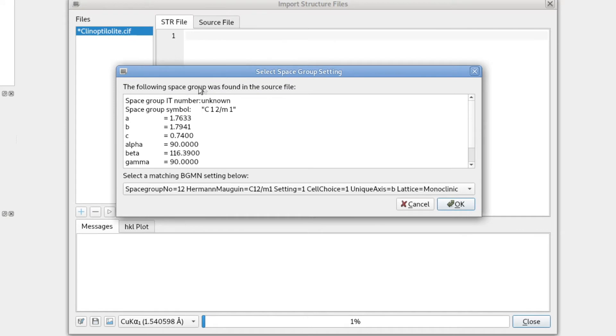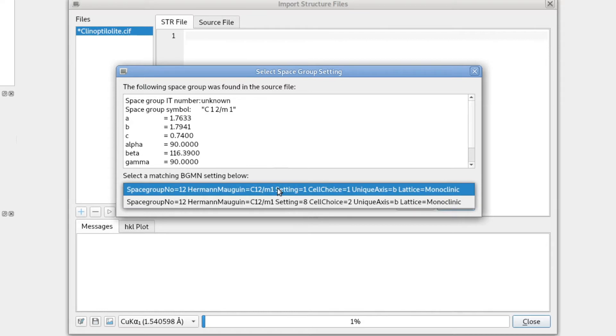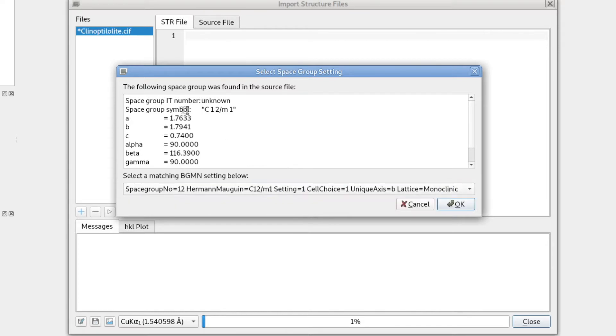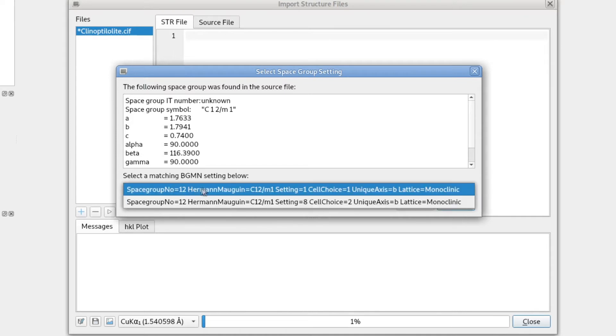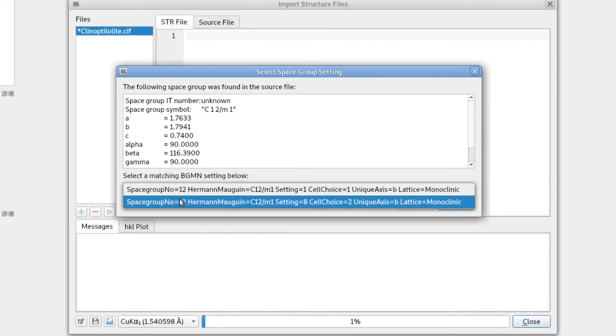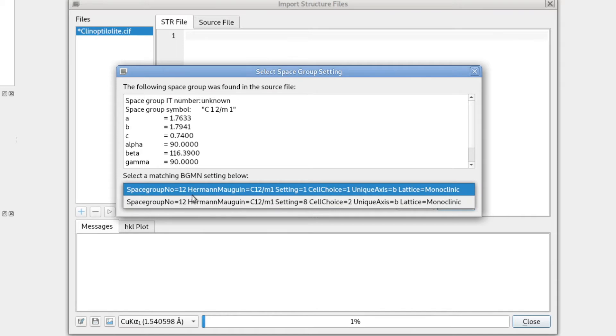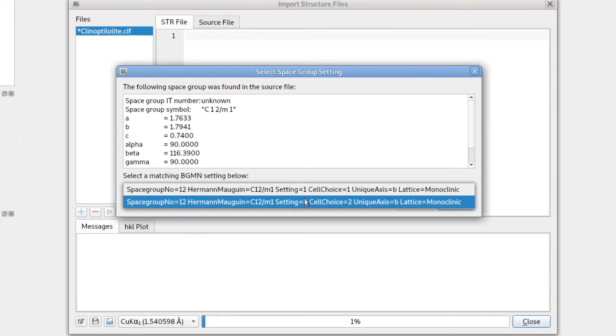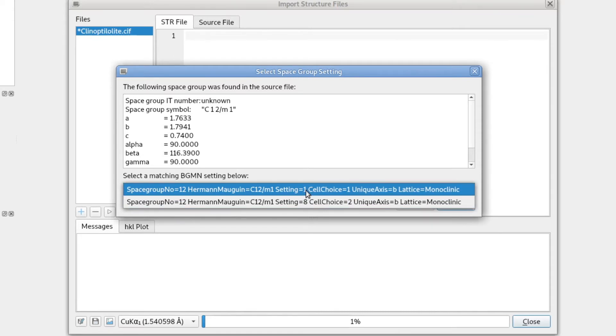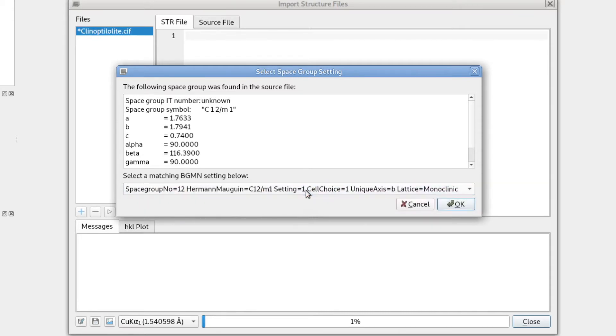It says the following space group was found in the source file, but we have to select the correct setting. There is no international tables number for the space group, but it found the Hermann-Mauguin symbol C 1 2 over M 1 and the cell parameters. But obviously in BGMN there are two different space group settings that both match this symbol. It's space group number 12. That was detected automatically even though it was not specified in the CIF file. And then we have two settings, setting number 1 and setting number 8. And now we have to decide which one is the correct one.